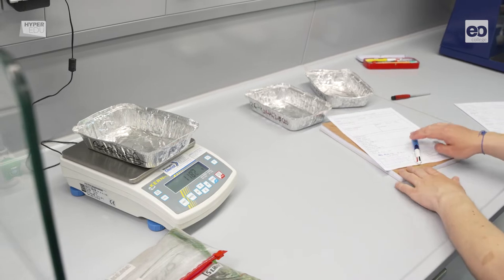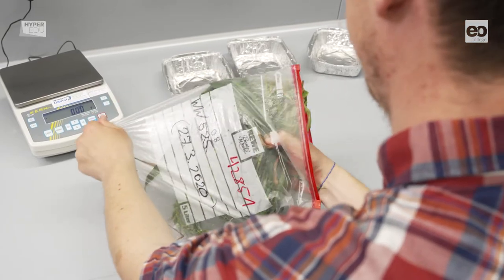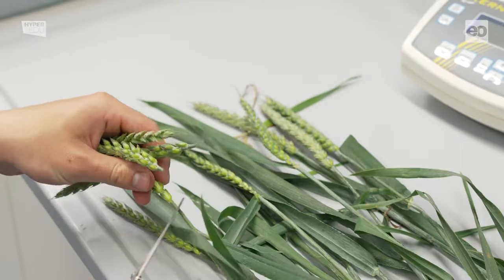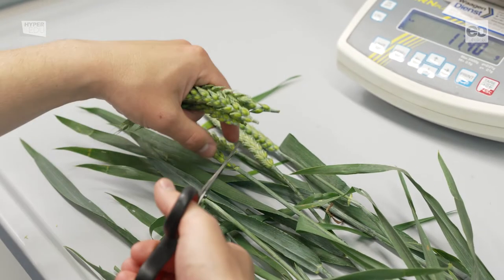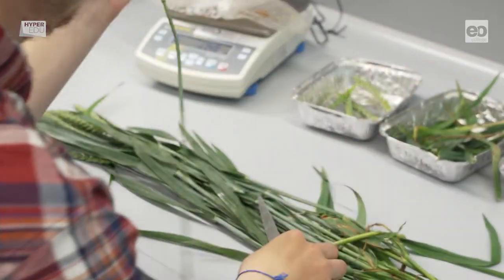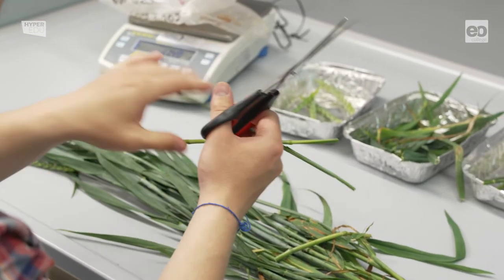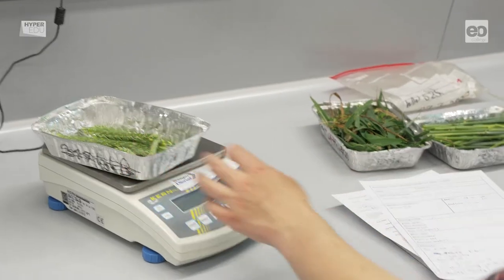Now he also records the weight of an empty sampling container and unpacks the biomass sample from its bag. Next, he carefully disassembles the plants. The ears go into one sampling container, while the leaves and stems go into separate ones. Just as Stephanie did before, Benedict carefully cuts up the plant material until all parts are sorted in their corresponding containers, and he records their weights.